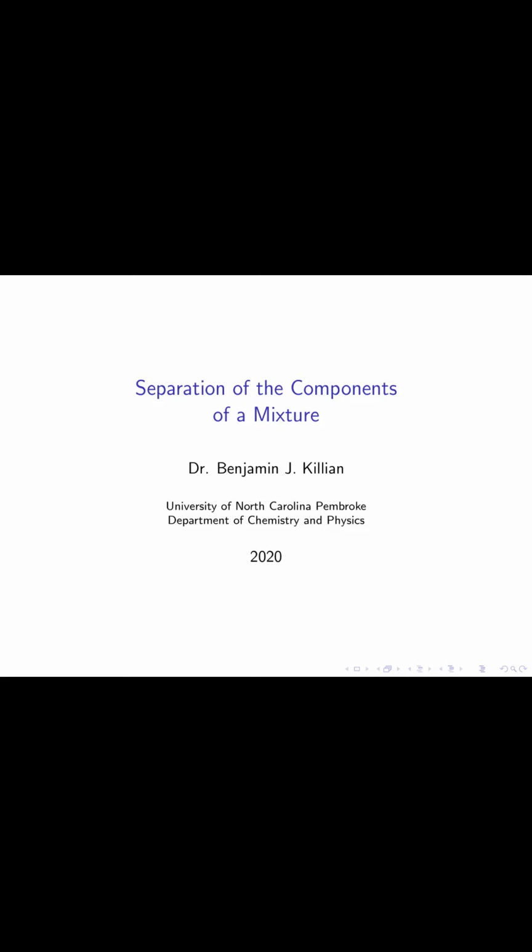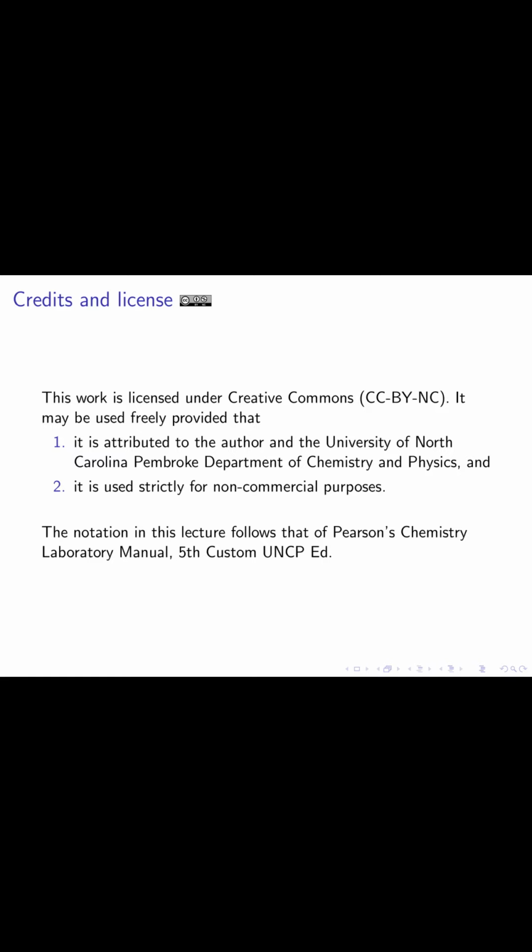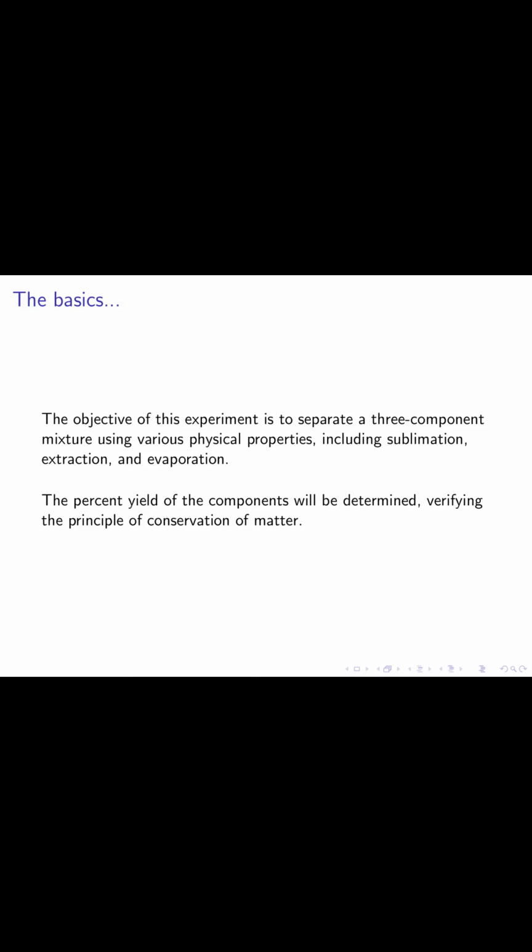Separation of the components of a mixture. The objective of this experiment is to separate a three-component mixture using various physical properties, including sublimation, extraction, and evaporation. The percent yield of the components will be determined, thus verifying the principle of conservation of matter.